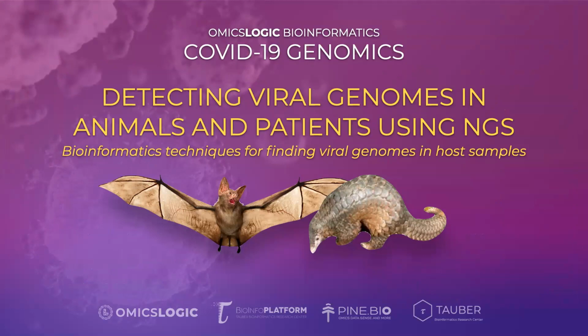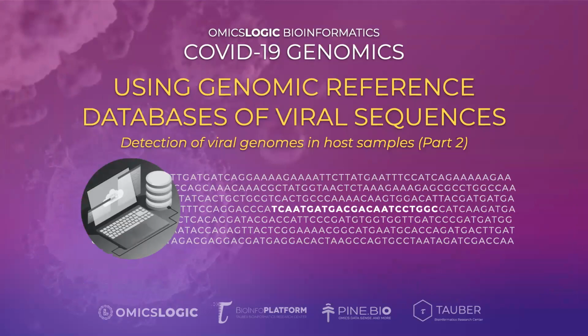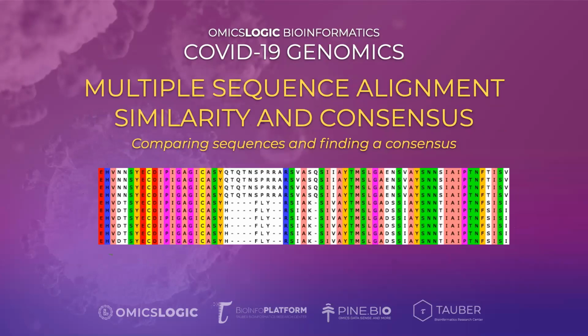Then we'll talk about different types of databases for viral sequences, where we'll continue the same analysis, but we'll start looking at good and bad examples and what kind of information we can extract from these different databases. And then we'll talk about sequence similarity, so multiple sequence alignment. How do we study similarity? How do we also study differences? And how do we develop consensus genomes, or what is the prevalent genome in a specific sample?